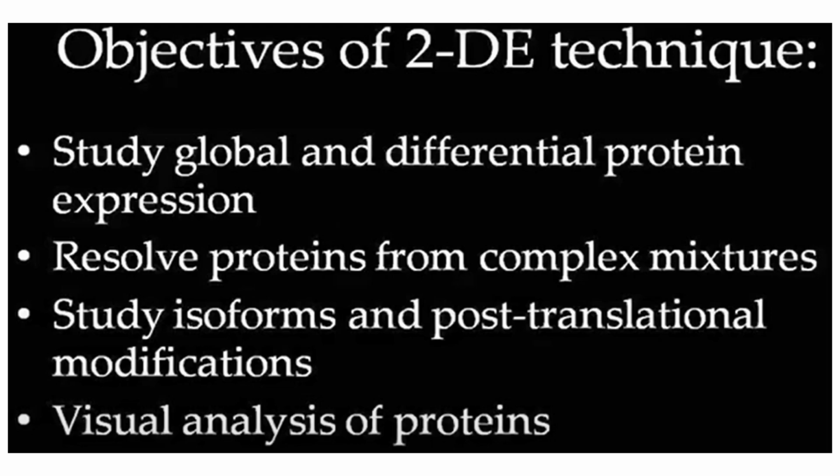You can use a blood sample or a cell culture sample. For example, some cells are mutated and some cells are not. They will produce different sets of proteins, and the normal wild type will produce a different set of proteins. Once you lyse those cells or extract the proteins, you have a complex mixture. 2D gel electrophoresis will help you resolve them.